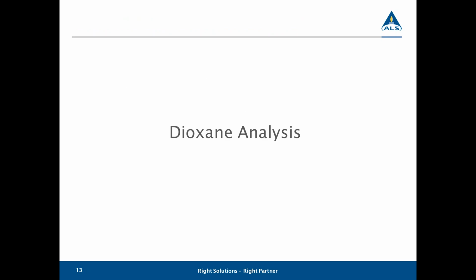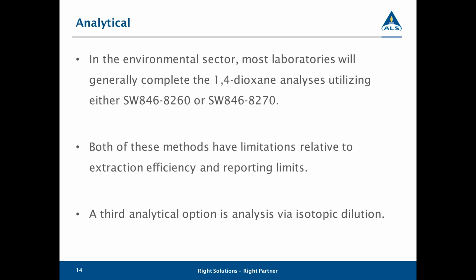For the analysis, which is really what I wanted to talk about today, I just want to give some background on it. There are several techniques out there for the analysis. Most laboratories generally use one of two techniques for it. Historically, it's been either SW846 methods 8260 or 8270. Unfortunately, both of these methods have some limitations relative to both extraction efficiency, if you will, or purging efficiency, as well as the reporting limits.